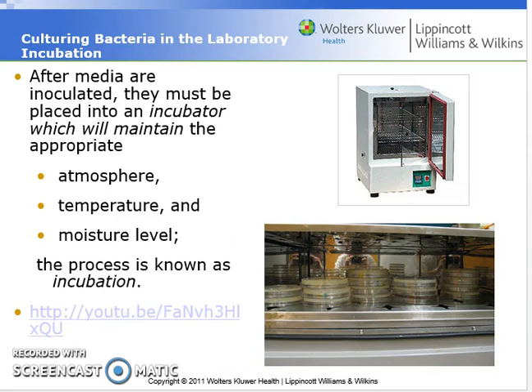Now, once we have our plates or test tubes inoculated, the next step is to incubate them. This is the same as incubating chicken eggs, or bread in the oven, or anything. With incubation, you let things sit at a specific temperature, the appropriate atmosphere, the appropriate moisture level, but most importantly the appropriate temperature, because remember, temperature is a big influencer in dictating and controlling microbial growth.